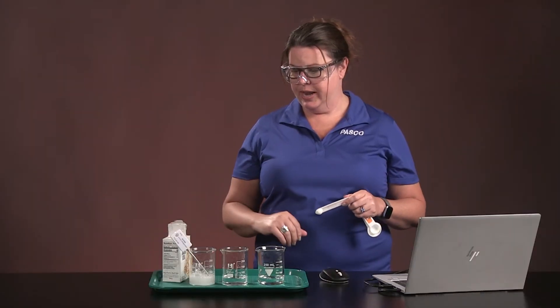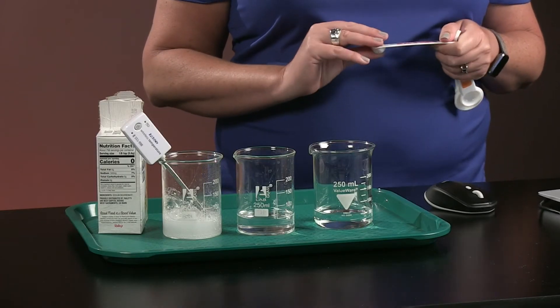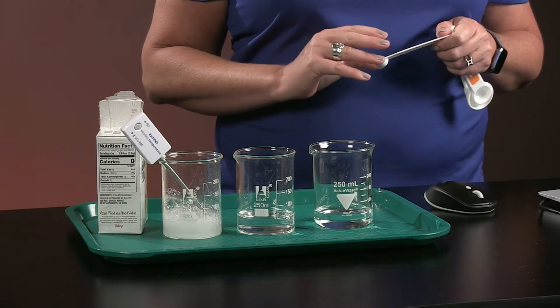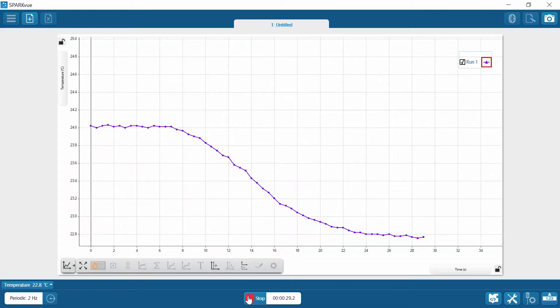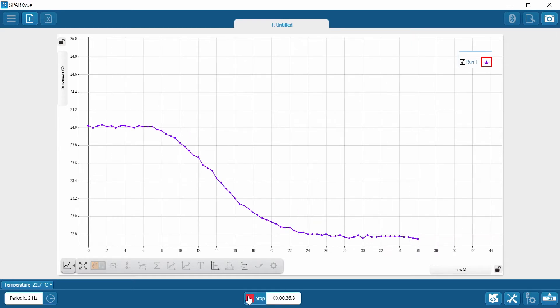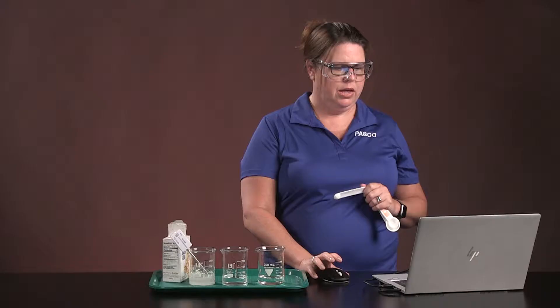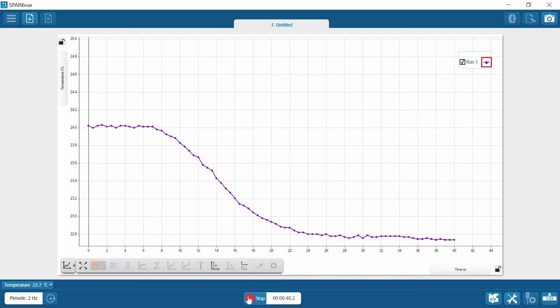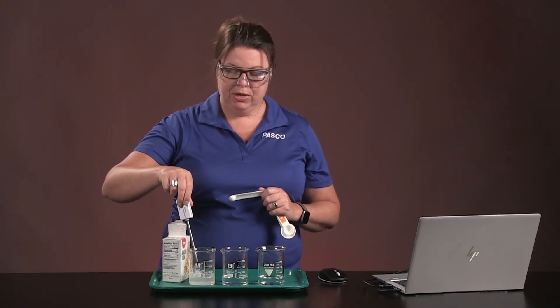I've noticed that bubbles are forming, and there seems to be a good drop in temperature occurring — that's pretty interesting. We're going to let this run until the data starts to level off or plateau. The data is starting to level off, so I'm going to stop recording and then move to the next beaker.